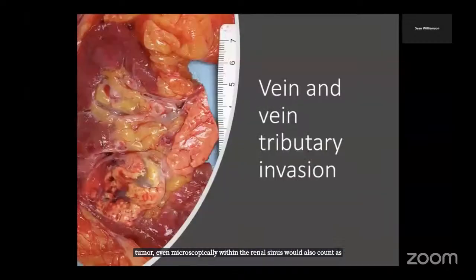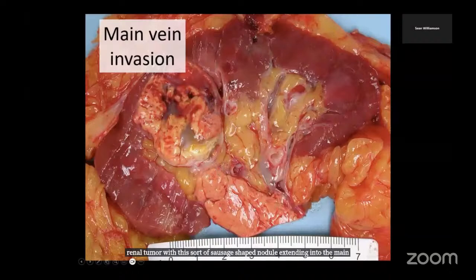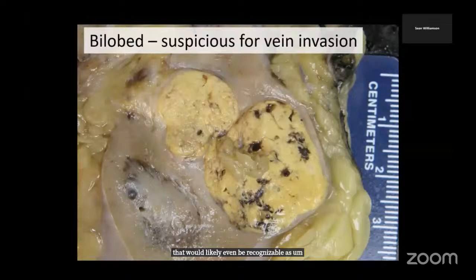a renal sinus invasion. So in terms of larger vein involvement, here's an example of a large renal tumor with this sort of sausage-shaped nodule extending into the main renal vein branch at the hilum, extending down toward the 3 centimeter mark of the ruler here. So that would be kind of a classic example of a large vein branch involvement that would likely even be recognizable as in the main vein outside of the kidney, perhaps.